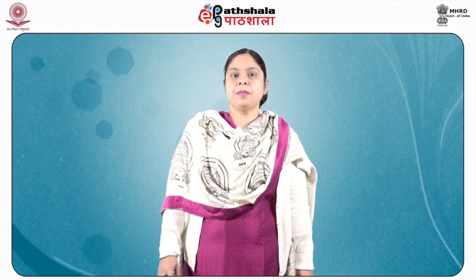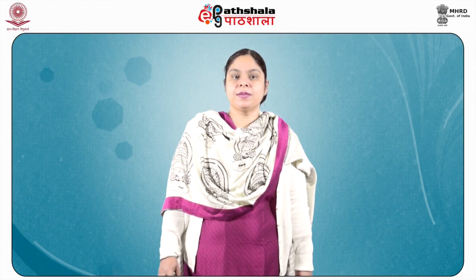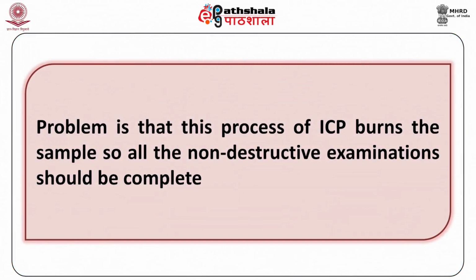The samples can be analyzed quickly. Now, the intensity of each line is compared to the already measured intensity of the known samples of elements, and their concentration is then determined. Thus, this process plays a very vital role in elemental analysis. But the problem is that the ICP burns the sample, so all the non-destructive examinations should be done before this analysis.